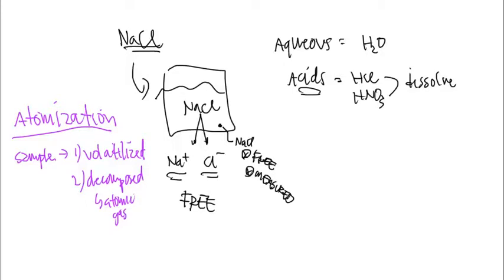It's the most critical process of the atomic absorption spectrometer that we know of. Everything has to revolve around the process of atomization. So if I want to be reproducible, and I want to make sure that I can reproduce the results from analyst to analyst or from day to day, then this process has to be gone through with a fine-tooth comb. I have to make sure that everything is working properly like it should be. If I want a very precise answer, then the same kind of thing is happening here.